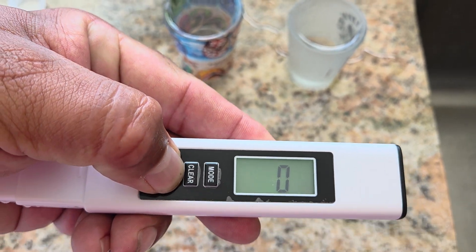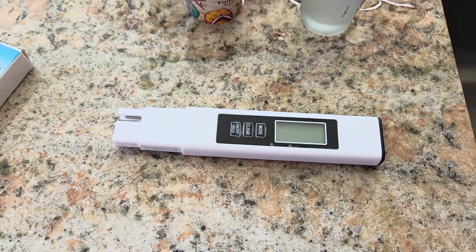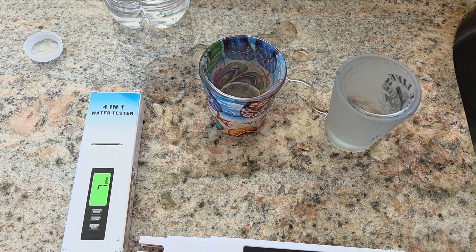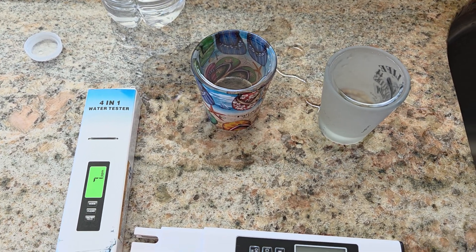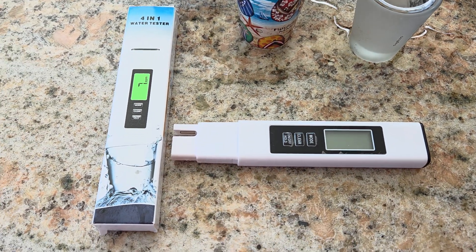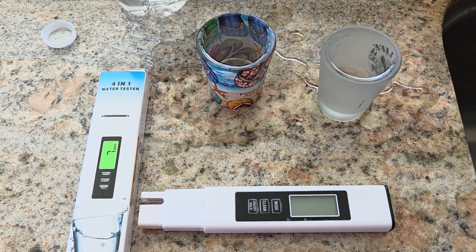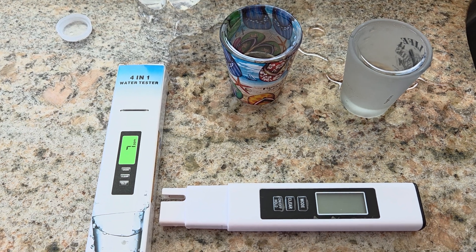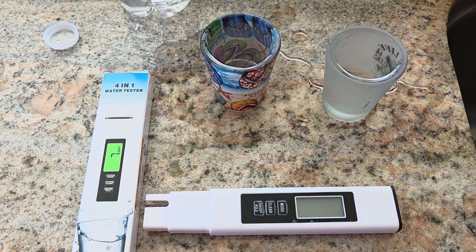To turn it off, you just press and hold the power button and it's off. So if you're looking for something to test your water and just give you an idea of what you are drinking, then get this little 4-in-1 digital water tester. It's a nice little thing to have around the house, just if you're curious about what's coming out of your faucet or your fridge. Get it as a gift, get it as a gadget, and try it out. Thanks.